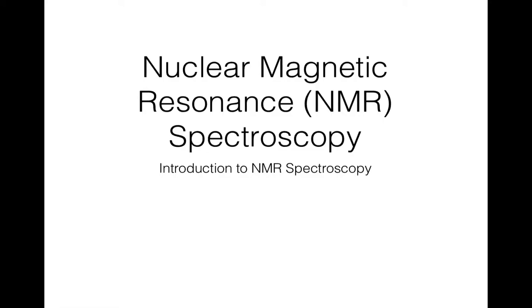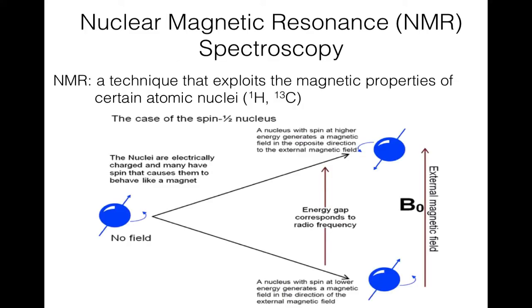In this experiment, proton nuclear magnetic resonance spectroscopy (NMR) is used to identify unknown organic compounds. Nuclear magnetic resonance, NMR, is a spectroscopic technique that detects the energy absorbed by changes in the nuclear spin state. An NMR instrument allows the molecular structure of a material to be analyzed by observing and measuring the interaction of nuclear spins when placed in a powerful magnetic field.